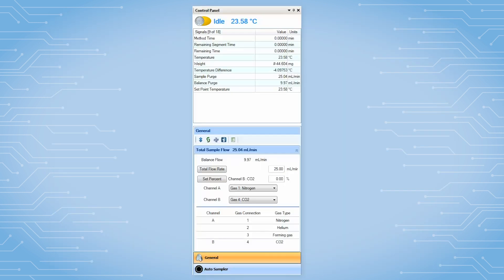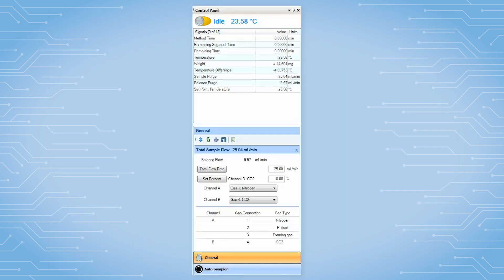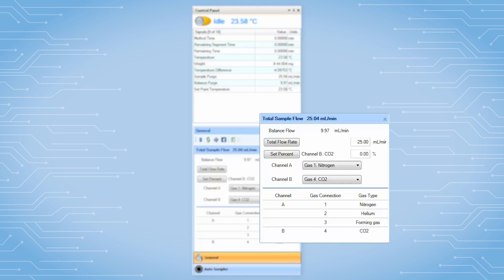When the Blending GDM is attached to the Discovery instrument, a control panel like this is displayed in the TRIO software.